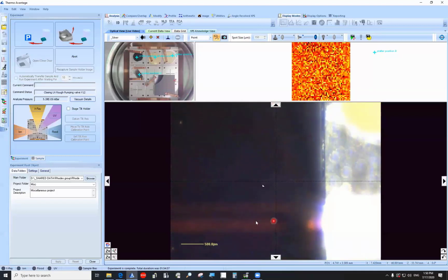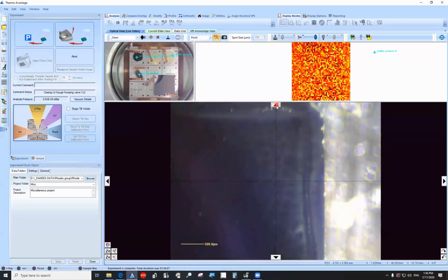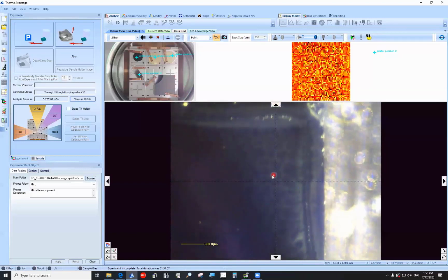I think this is the underlying portion of the stage, the top plate you're seeing just through your film, because it's on a transparent substrate. So based on the contrast that you see here optically, this might be one thing that you can use to identify both focus and region of interest. One other thing that you can do is to try to map out where the elements of interest exist and not rely solely on optical contrast. So that's the last thing I'm going to show you here.